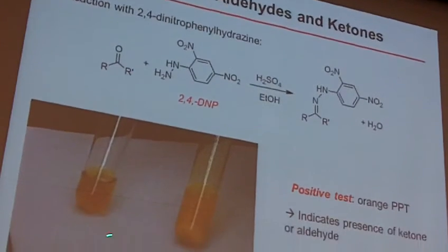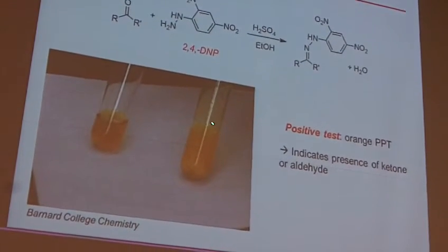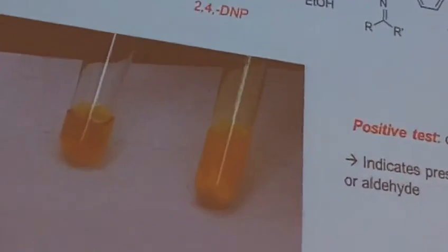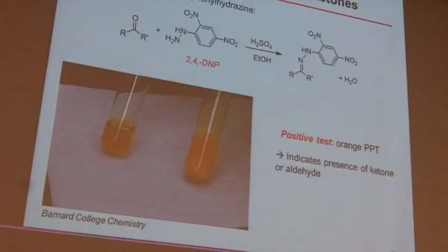This doesn't show up really well here. Ultimately, you have that clear orange solution as your DNP reagent. You end up with the orange solid, which looks like the Tang-type solution there on the right. A positive test gives you this orange precipitate, and that tells you that you have either a ketone or an aldehyde present. So that one's a repeat of something that we did last year.